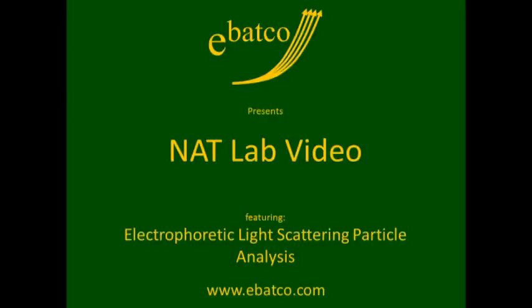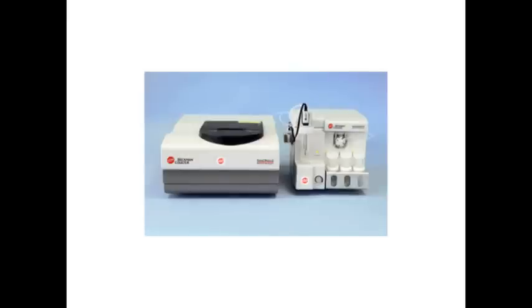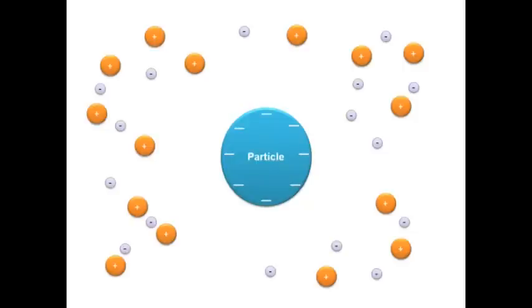In this video, we will take a look at a quick way to measure zeta potential using electrophoretic light scattering. Most colloidal particles have an electrical charge in liquids. Let's take a look at an example.